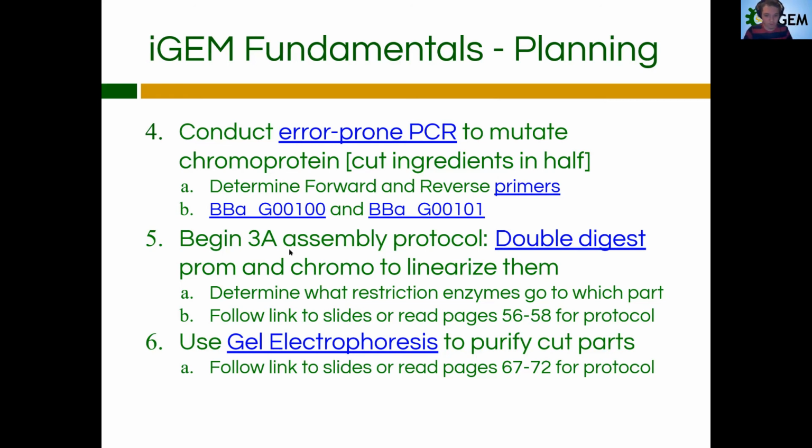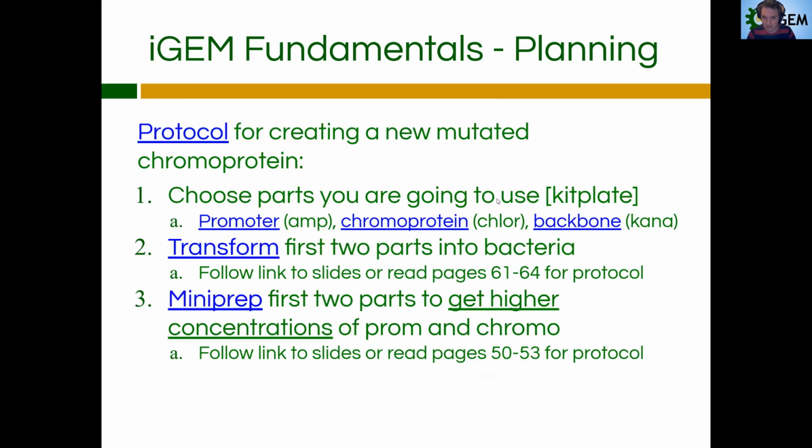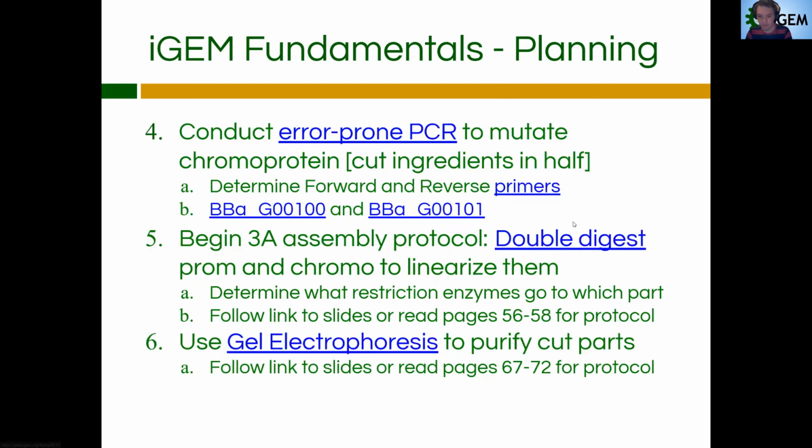Next, I want you to outline the 3A assembly protocol. This is where you start the 3A assembly protocol. So you start with the double digestions, where you're starting to cut your parts away from the plasmids, so they're just the parts themselves. It's not all the external gunk that you don't need. It's just the chromoprotein. It's just the promoter. It's not the backbone.